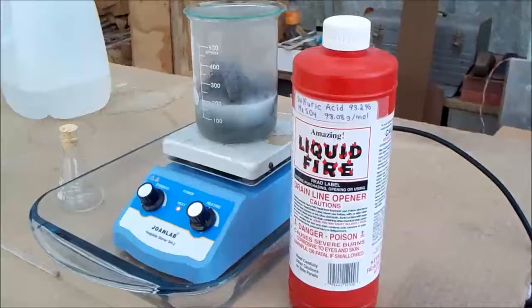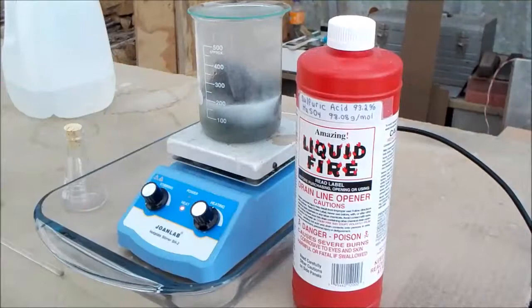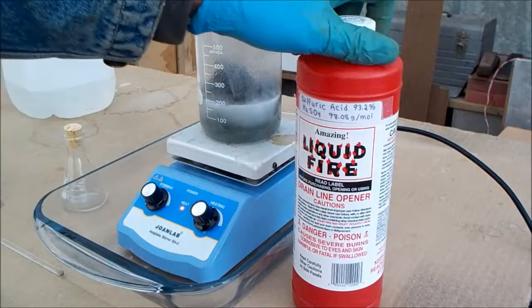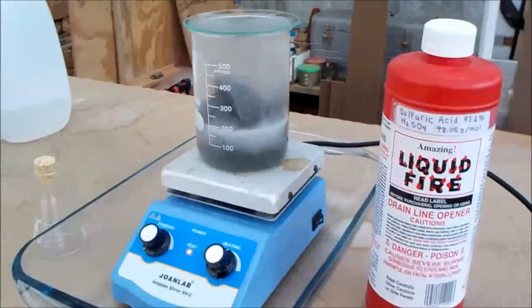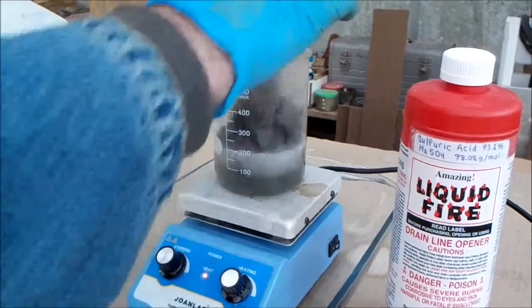So here's a little bit more information about the drain cleaner that I used. It's actually called Amazing Liquid Fire, and my research indicated that it's about 93.2% sulfuric acid. And as you can see, the reaction is going along quite nicely. I think I'll take this opportunity to add a couple more pieces of steel wool. Maybe give that a stir.